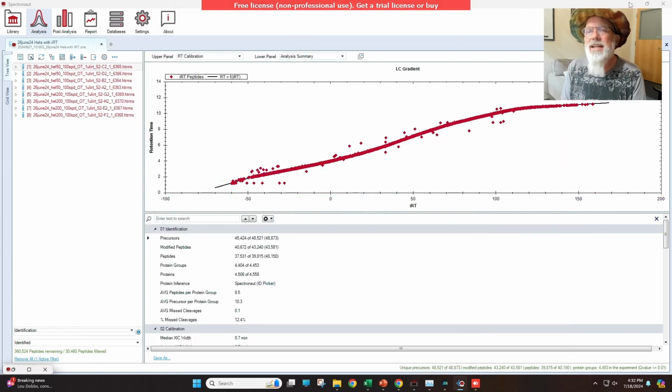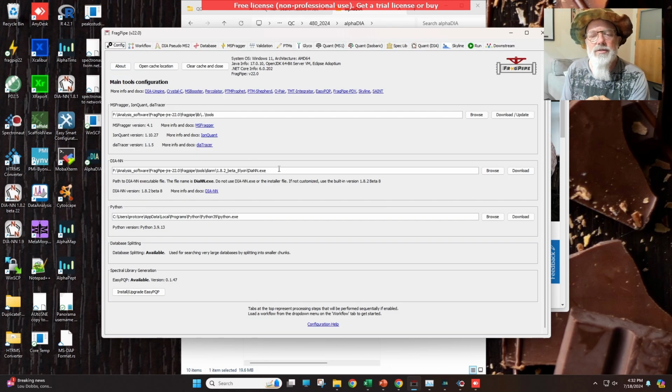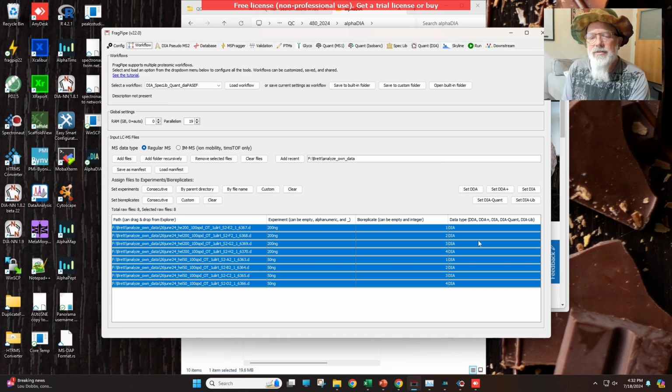All right, everybody, we're back. Where we left off, we were doing the newest version of FragPipe, version 22. We went over where to download it, how to get it running, how to add your files, and how to tell the software it's DIA. Even though this is timsTOF, I just noticed we didn't check the ion mobility MS data. As far as I know, you don't have to; I checked with the authors of the software, and it automatically knows it's ion mobility if it's timsTOF. So I don't think we screwed that up.